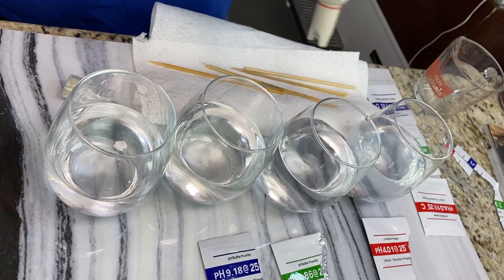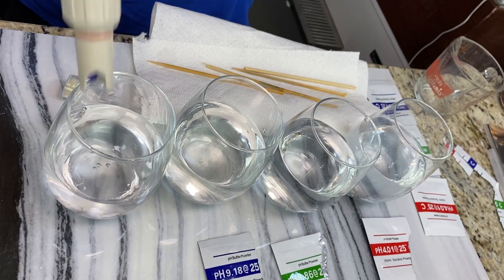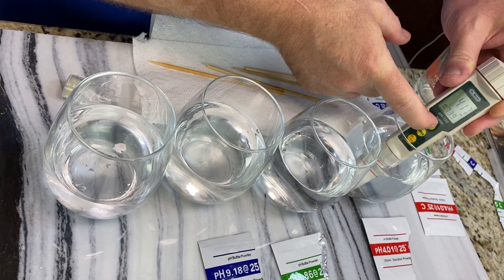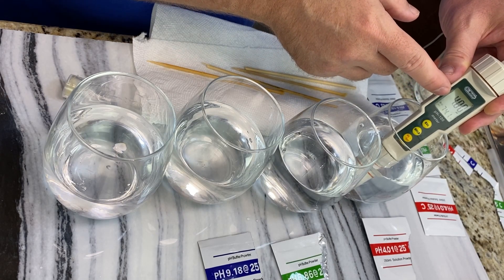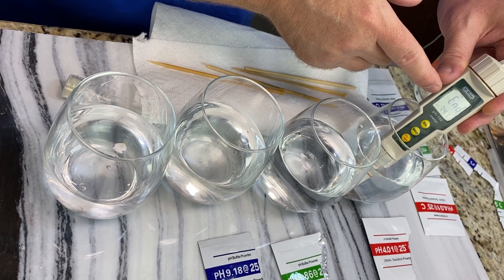Take it out, rinse it off in distilled water, then go to the 4.01 solution. Same thing — hit calibrate, hold it for three seconds, it pops up and says calibrate, then fixes it to 4.00 and saves it. Done.